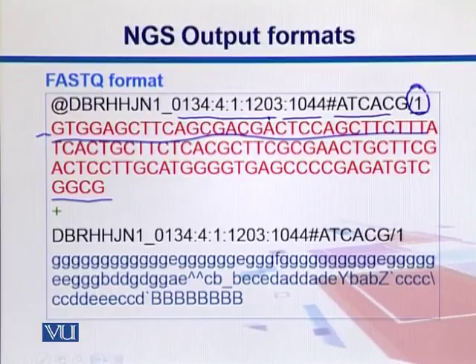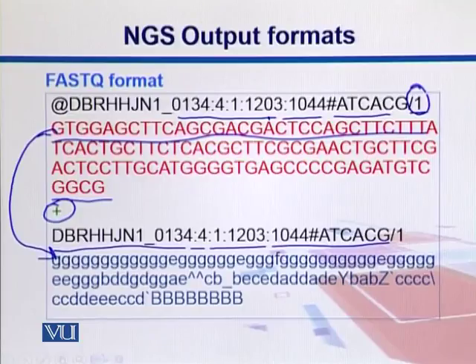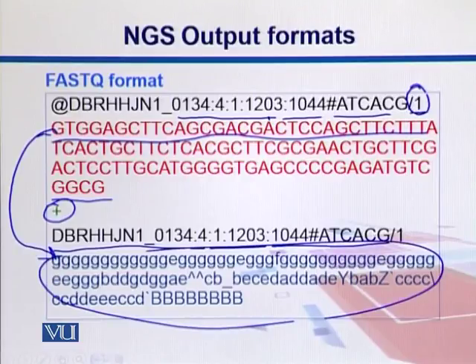Then we have the same ID, separated by a plus sign. So we have the quality score down there. For this G, we have a quality score represented by a small g. That quality score is looked up for its corresponding ASCII character, and that character is placed. If we put those scores like 40, 50, whatever, we would have a large amount of data over there, and it would also be hard to have a one-to-one correspondence. So for that, we represent these scores in these ASCII characters.